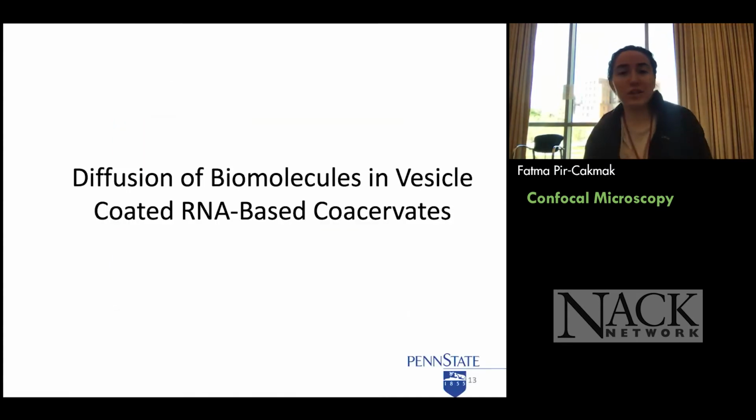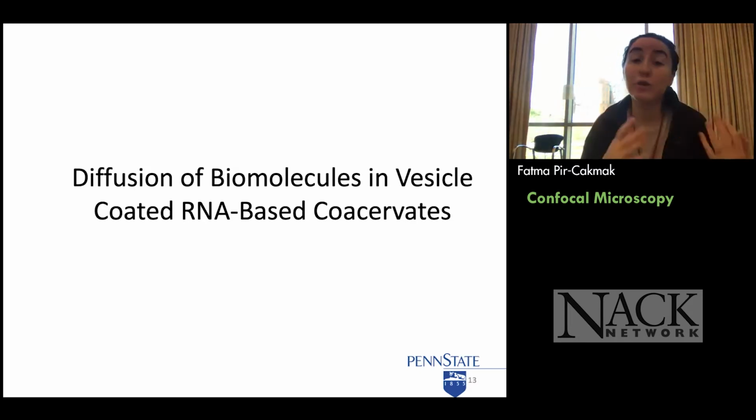So I mentioned the background of how people use confocal microscopy. You can do interesting experiments with confocal microscopy, such as diffusion experiments. I'm going to go into a little detail about what I have done for my PhD at Penn State. I will talk about diffusion of biomolecules and how you can calculate this in a research setting.